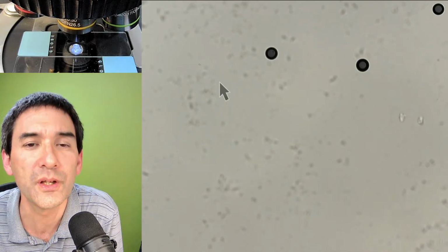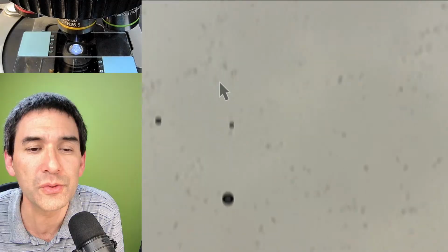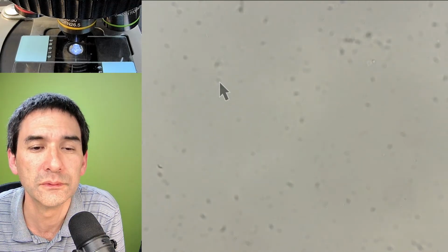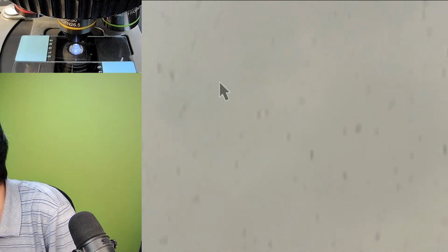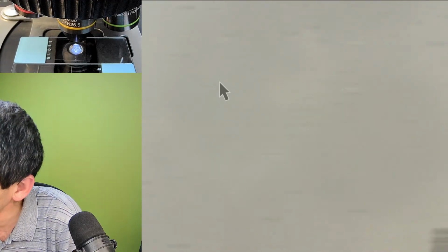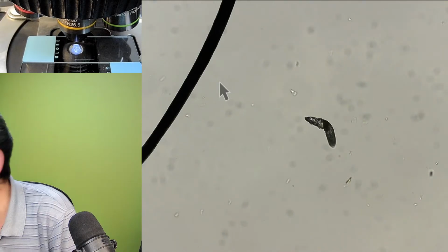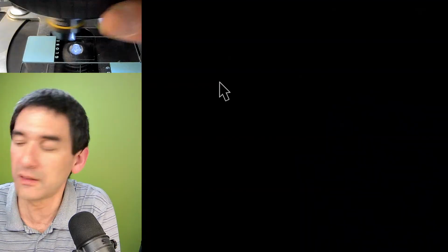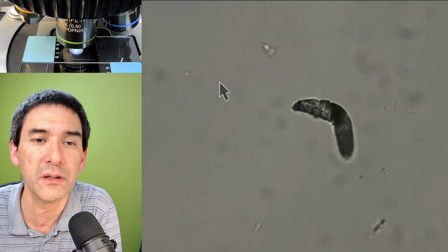Interesting. What are these round structures? Are these also some bubbles or something? Because they were not there before. Let me quickly have a look. Oh, these are air bubbles. Why are the air bubbles there? Yep, here it is again. The face mite still seems to be alive.